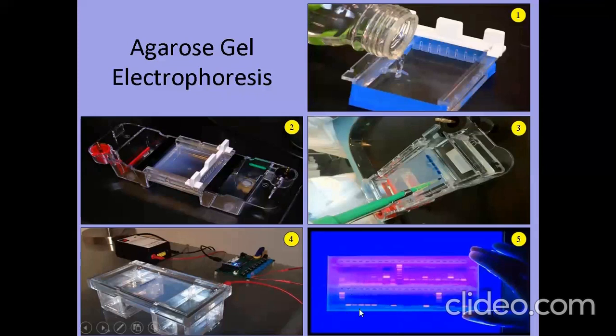Look into this gel. If you observe this gel, it starts from here to here, and you can see this whole area is bluish in color, and this area is reddish in color. That means we have run the gel, the electrophoresis has occurred, and the ethidium bromide moved in this direction, and the DNA has moved in this direction.